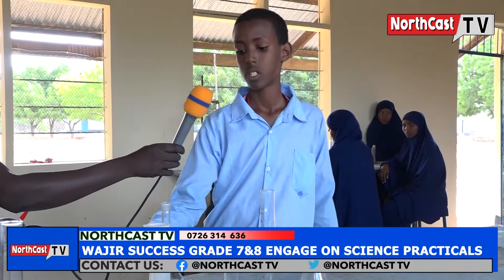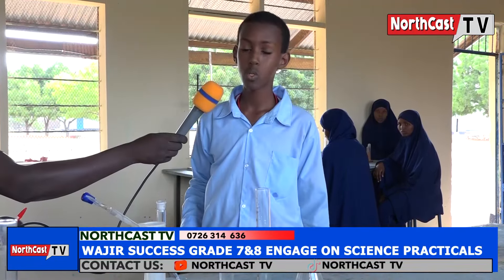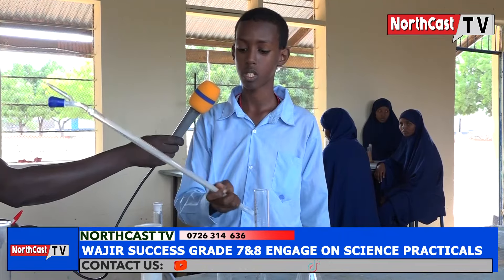Under the category of those used for measuring volumes that are not fixed: number one, we have the burette. It is used to measure accurate volumes of liquids. Second, we have the syringe. It is used to measure and transfer accurate volumes of liquids. We also have the graduated beaker. It is used to measure approximate volumes of liquids, but not accurately.